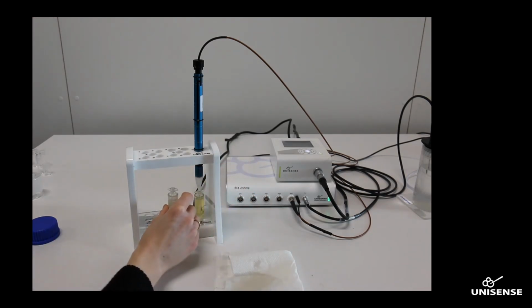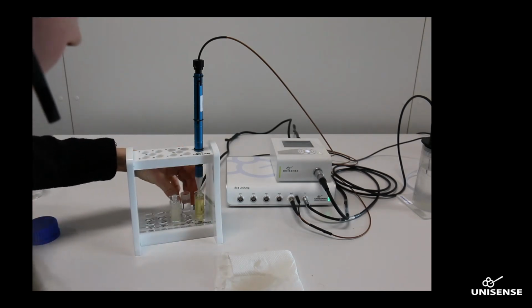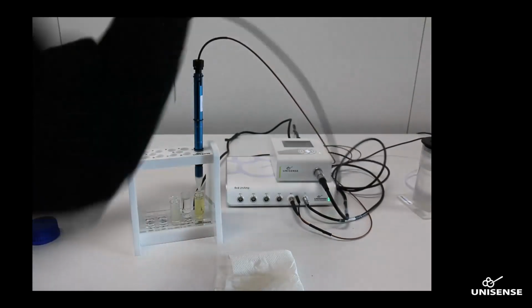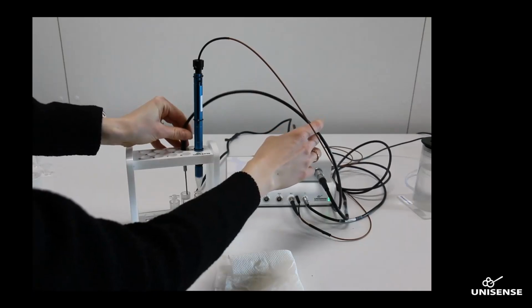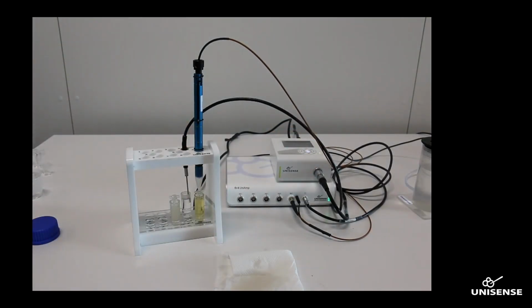Okay, so now I add it here to the rack. Because I'm doing it on the table today, I will also add just a solution of water that I can put my temperature sensor in. If you're working in a water bath, you can just add the temperature sensor into the water bath close to the rack.